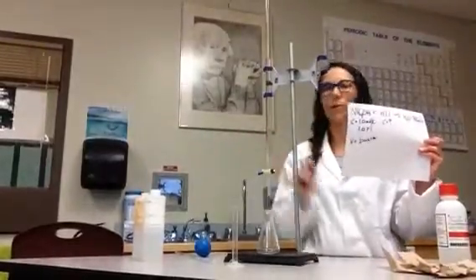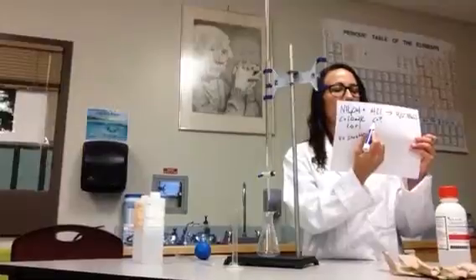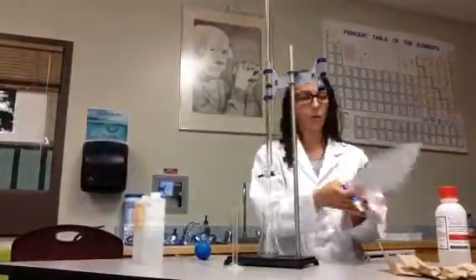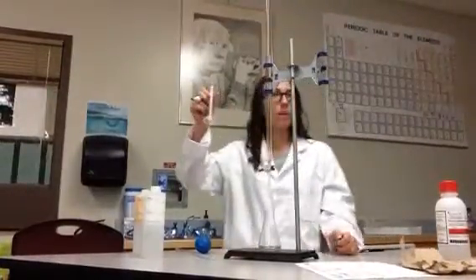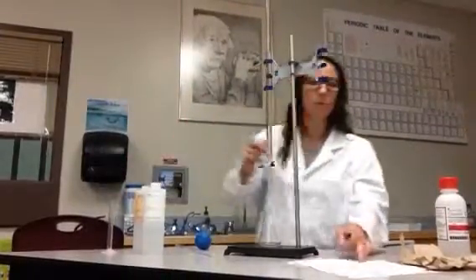The concentration is what the bottle says. Here I would like to find a concentration. Can everybody see that I'm going to need a volume for here too? So V equals, and I'm going to put 10 mils in, and have 10 mils reacting. If I measure my 10 mils with my graduated cylinder, it won't be 10.00. And I'd really like to have as many decimal places, as many significant digits as I can.